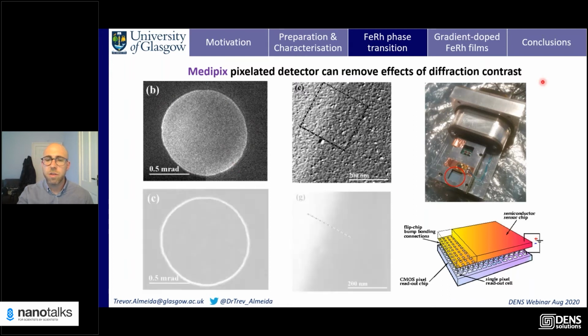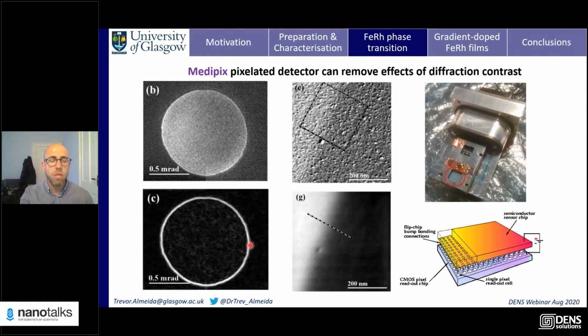And essentially what we can do is apply a mask to the beam. So rather than using the intensity across the whole probe, we can just measure the movement of the edge. And you can see quite a stark contrast in change of the noise and the signal. And this domain wall is very much clearer after we apply this mask and essentially perform phase correlation of the scan beam. So that's one way to use pixelated DPC rather than conventional segmented DPC.